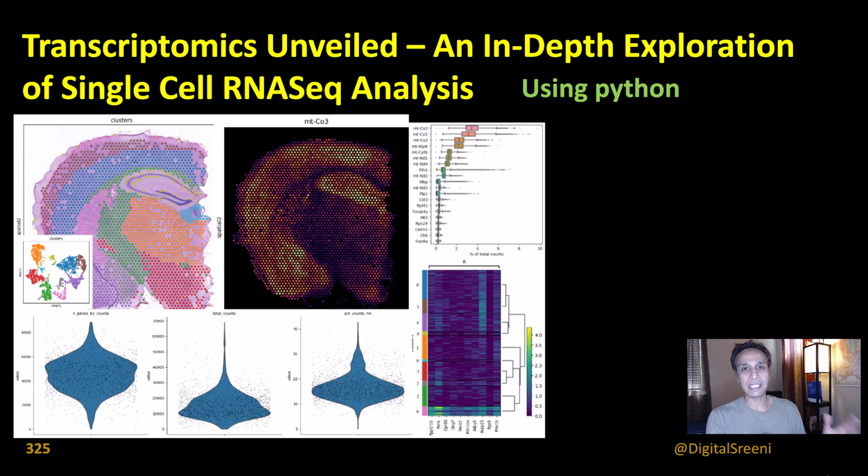is and what single cell sequencing is, and I'm not going to go a lot in depth in terms of what the technology is. We are going to cover a little bit of basics in terms of what it is and then jump into analysis using one of the data sets. And for those of you biologists who already are in this type of field, you probably know how spatial transcriptomics has exploded, especially in the last 5 to 8 years, especially since 2015. There are a lot of new techniques that are coming up.